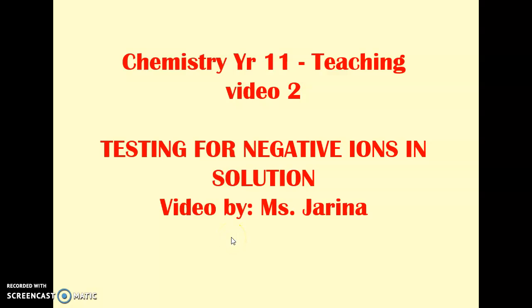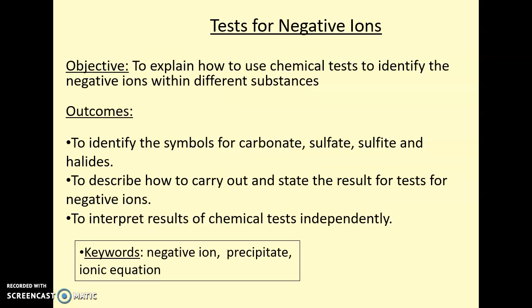Hi everyone, this video is about testing for negative ions in solution. The objective is to explain how to use chemical tests to identify the negative ions within different substances.